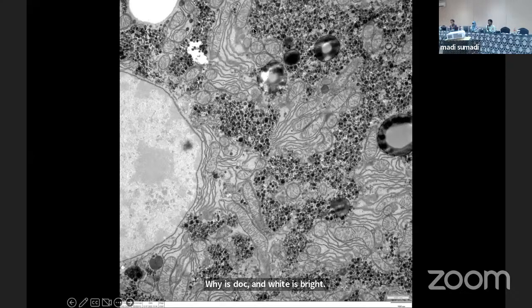So you can see the cytoplasm is very active, right? It is like a traffic jam. So many cars are going on the street. It is so full. The cell is very active. Hepatocyte. If the cell is active, it has to be triggered from the nucleus. Otherwise, they do not have the job. Everything has to come from the nucleus. Then only it can work. It means the nucleus has to work.